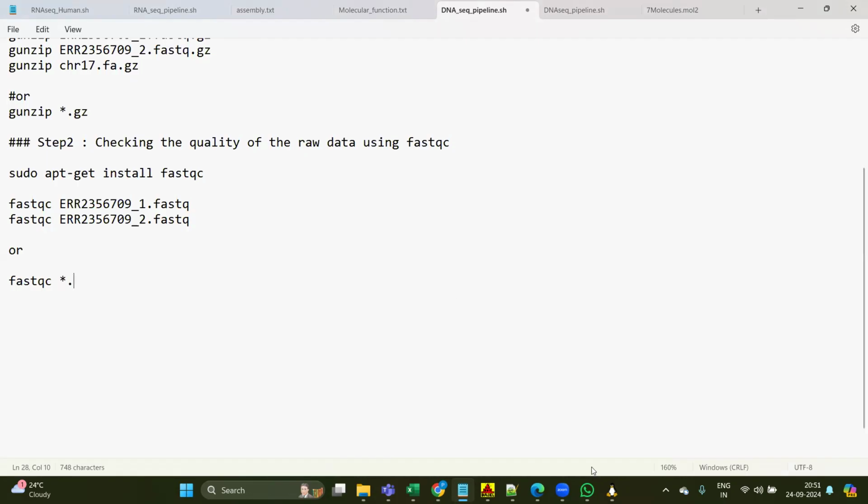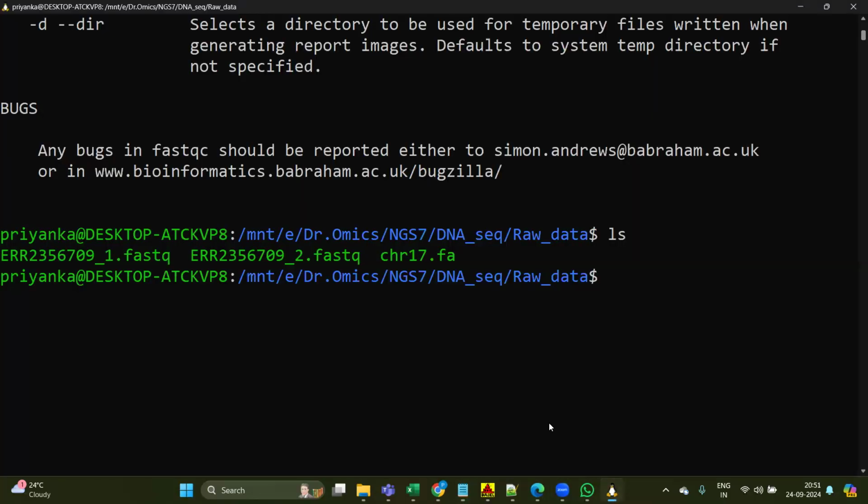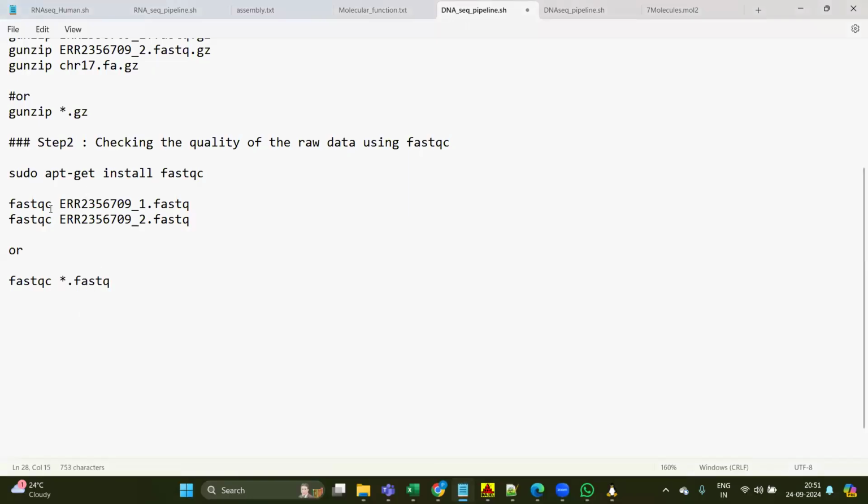Fastq. Yes, because here also, if you see in the WSL, these two files are having this .fastq extension in common, right? So you can provide this. And obviously this genome file will be required for the alignment purpose; till that step, we are not going to use it. Okay, so star.fastq. Again, if you want to use these two commands, you can use them also. If you want to use this one command, that's also your choice, totally your choice. So I'm just pasting these commands in the chat box for your reference, but try to create your own commands.